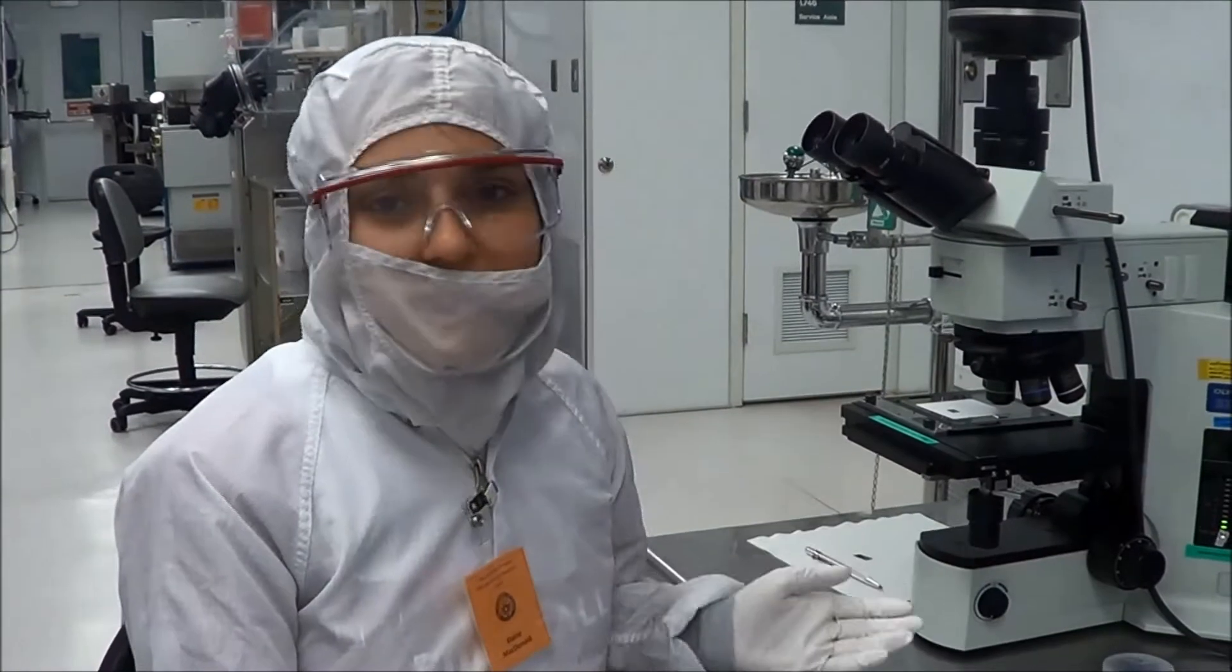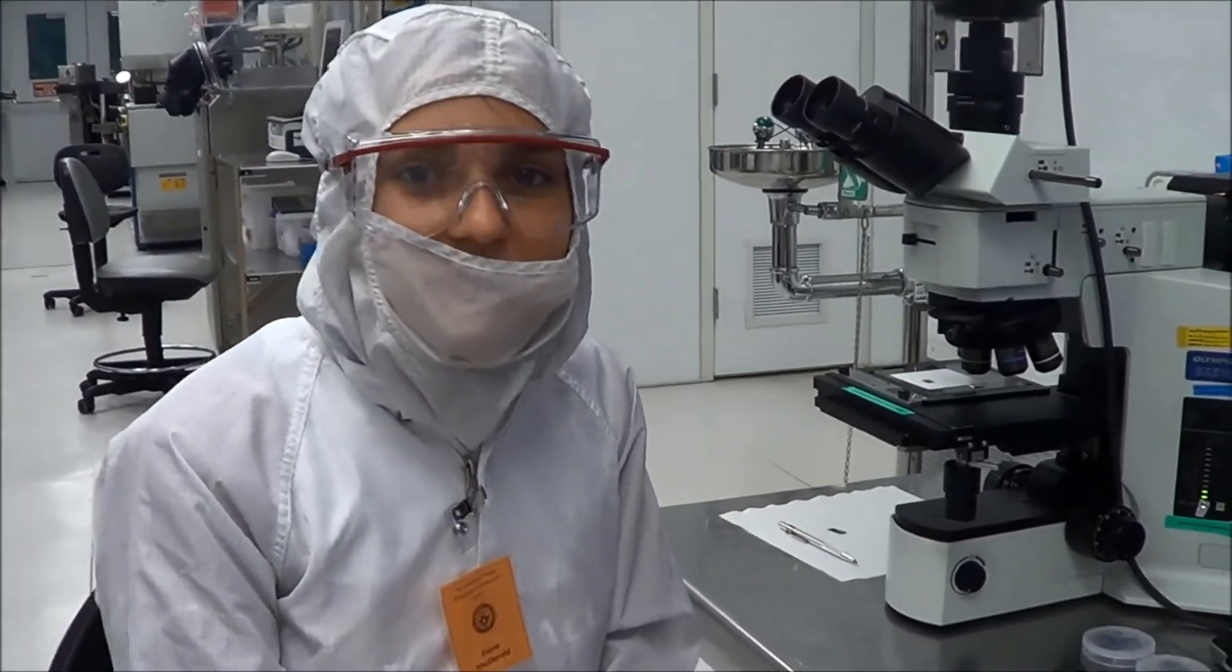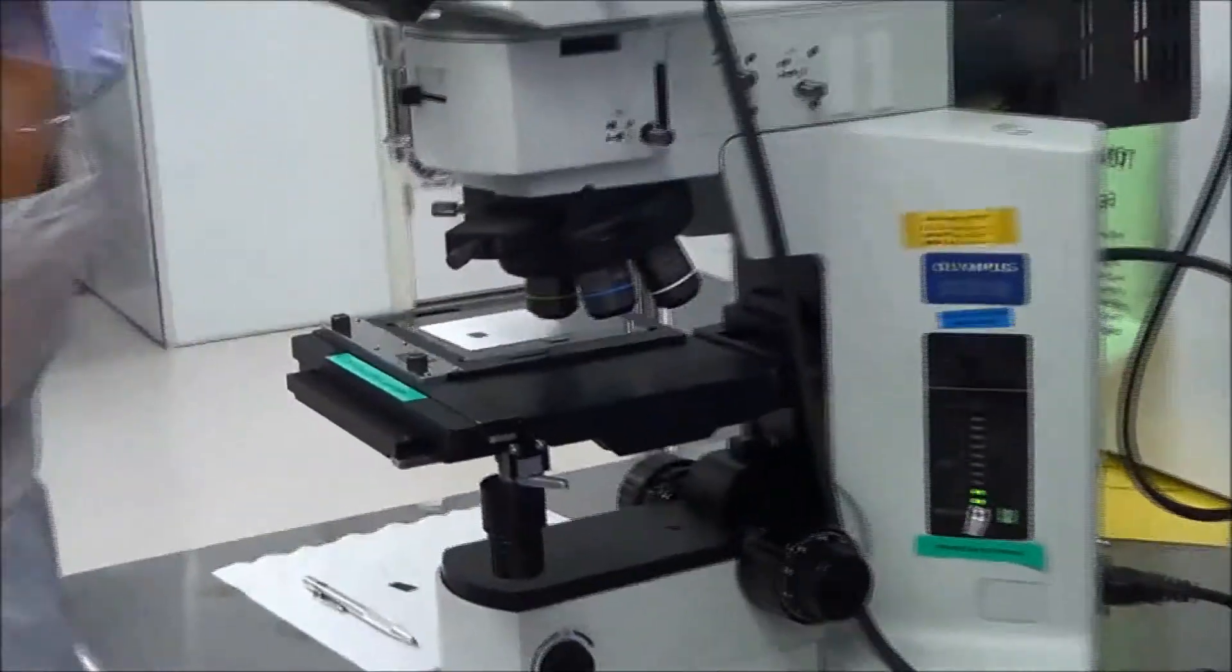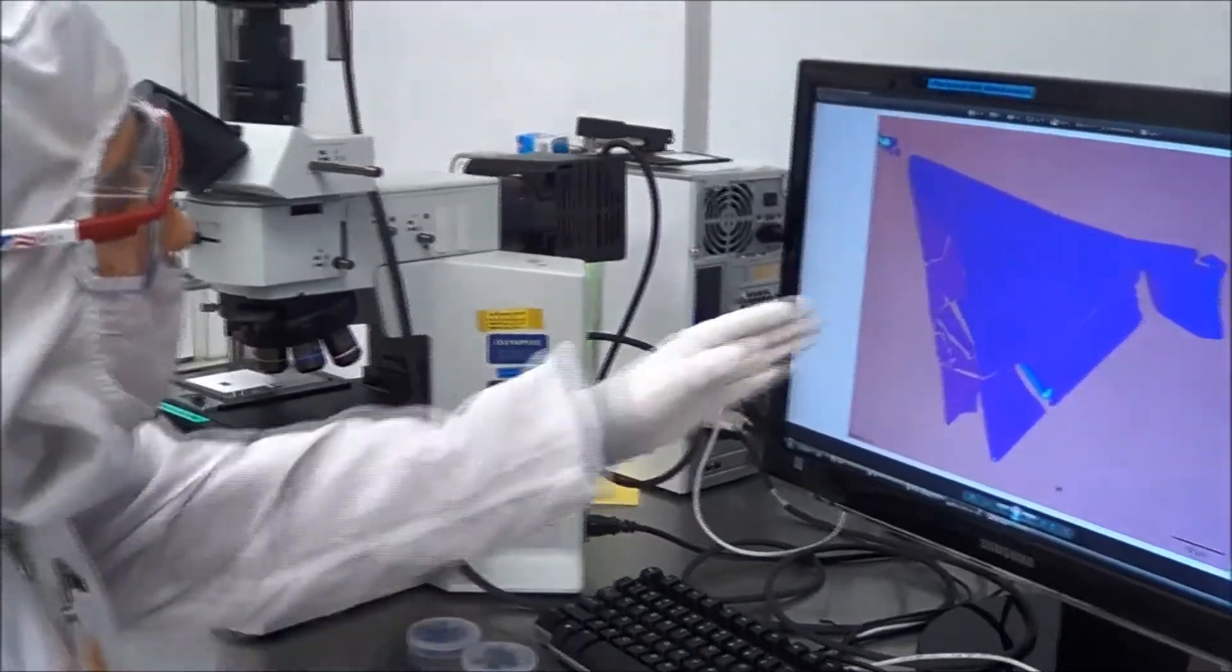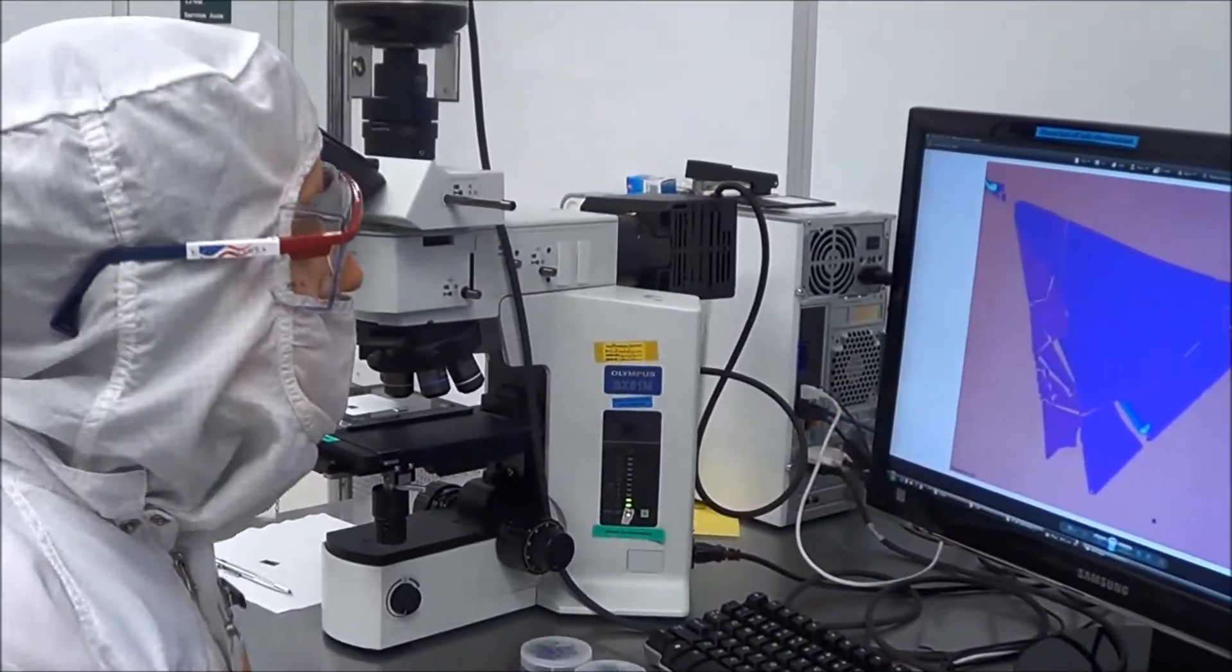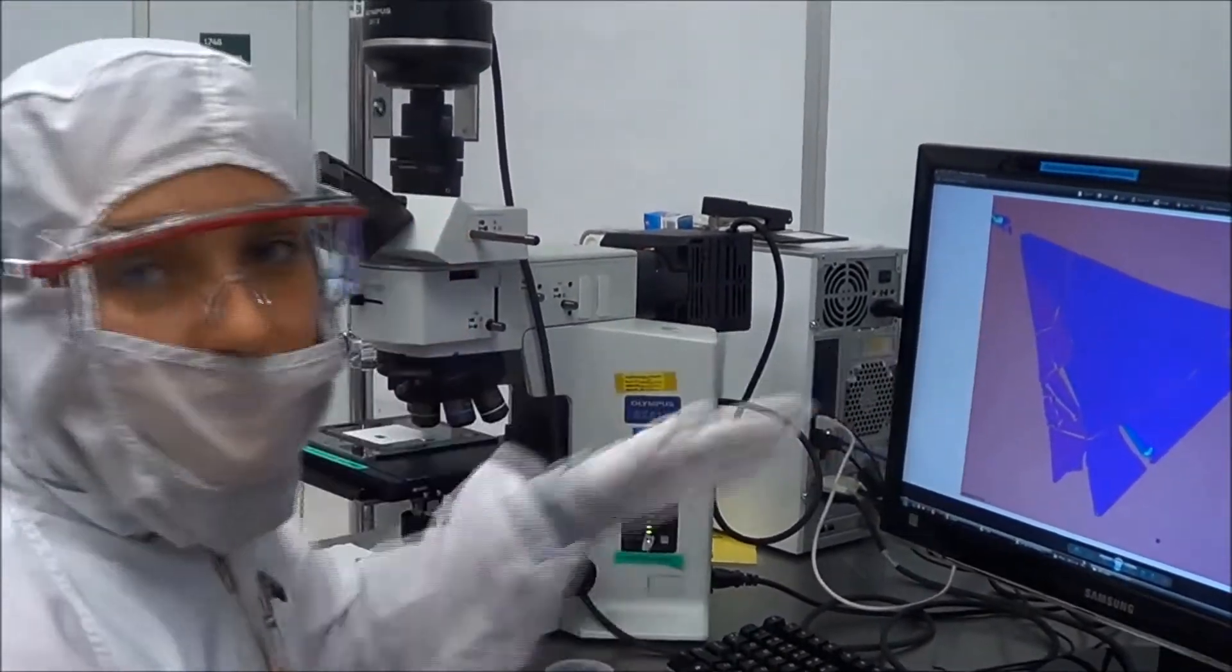Next, upload your exfoliated sample underneath the optical microscope. This is the next step in determining whether you achieve monolayer. We use this in order to observe the brightness and contrast. The brighter the flake, the thicker the flake. Here, monolayer appears to almost be a shadow.